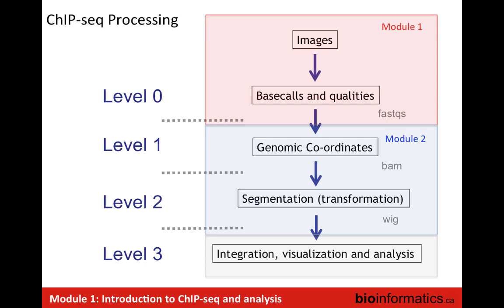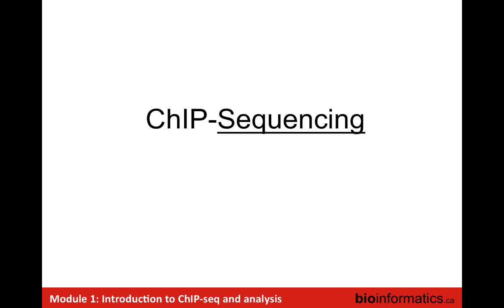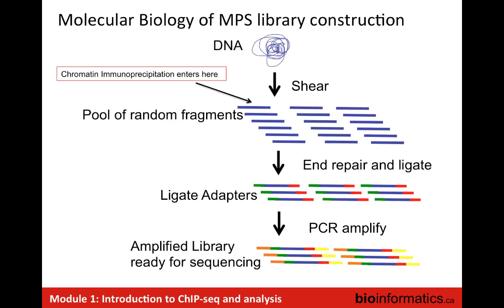So then, integrating it all together. Okay. Just to remember, everybody, with ChIP sequencing, sequencing underpins what we do here. Understanding sequencing is important. So let's just remember the basic workflow. We can start with any nucleic acid.